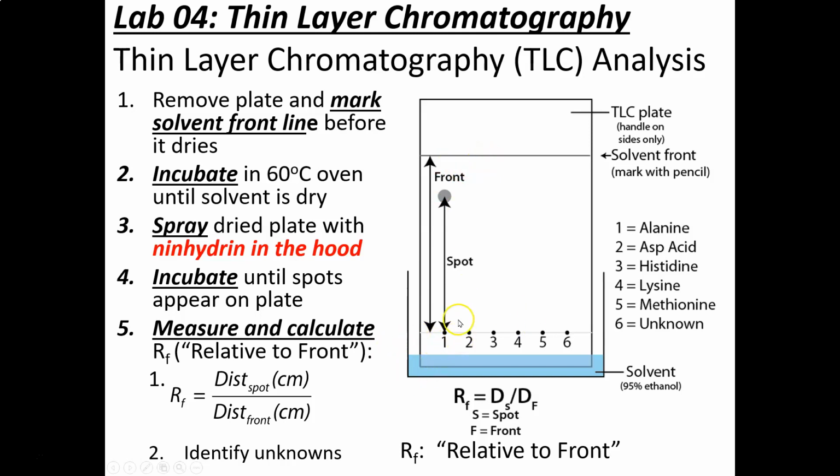All right, so in rare circumstances, we could have a 0. In virtually no circumstance would we have a perfect 1.0. And in all other circumstances, it's going to be a number between 0 and 1. So it's going to be point something. And that's a good thing to remember in your head. If you don't get point something for an RF value, it's likely you did it wrong.